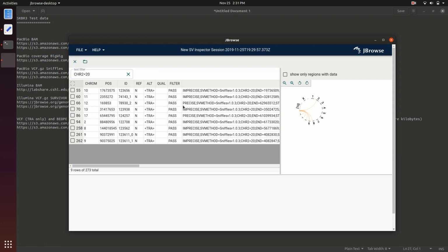Now you can imagine a lot more filters, and it's definitely something we'll add as needed. But this narrowed down our Circos view to only contain these rows from our spreadsheet. And that really clarifies some things. And we can also turn on this option that actually only shows the relevant displayed regions or the relevant chromosomes in this set.